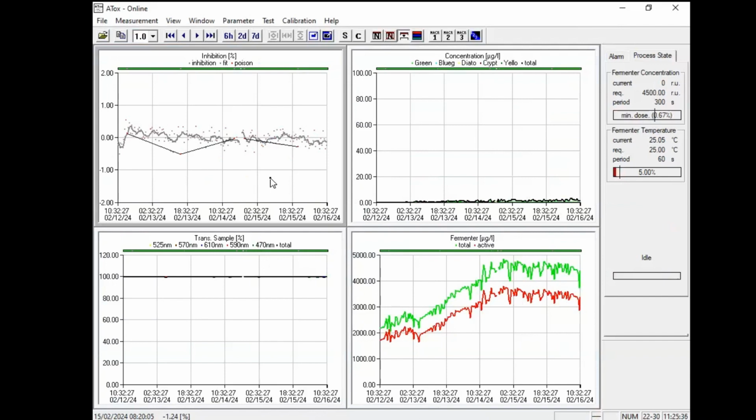Thank you very much. The other question is about, actually two questions remain. The first one is about in the manual it is mentioned that we can also clean with KOH, the potassium hydroxide solution. We can use it. What is the application? Why we need to clean it? Because you mentioned that we clean it with reference water, but maybe in some cases we need to use this. How essential is it? So how can we understand visually we should check it? Yeah. We need to do it.